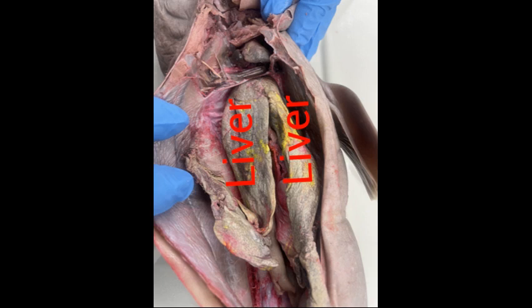In most sharks, the liver is very large and has two different lobes, and bile is secreted from the liver. Sharks eat a lot of things, so it's super helpful to have a large liver to help secrete bile, which helps to digest food to create energy so the shark can keep on swimming. The pancreas consists of a ventral lobe and secretes enzymes into the duodenum, helping it move along. And that should be it for the digestive system.